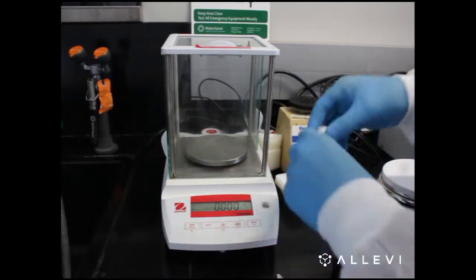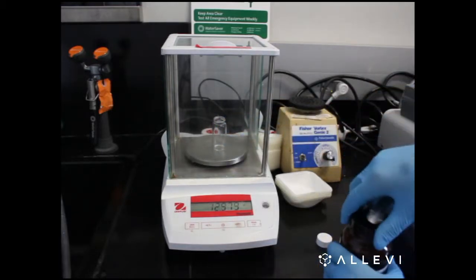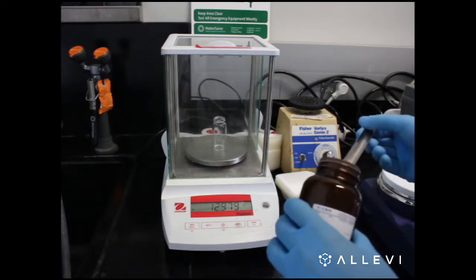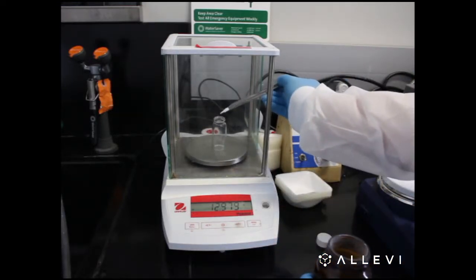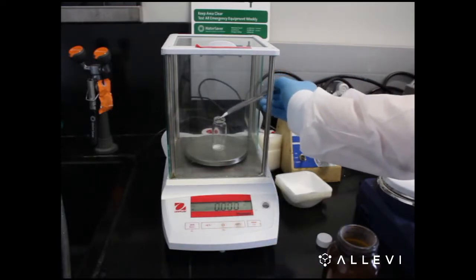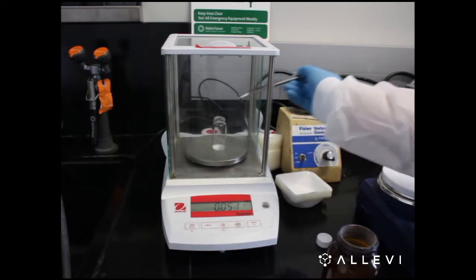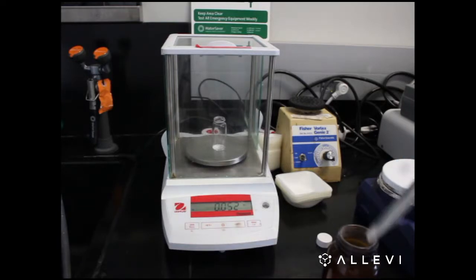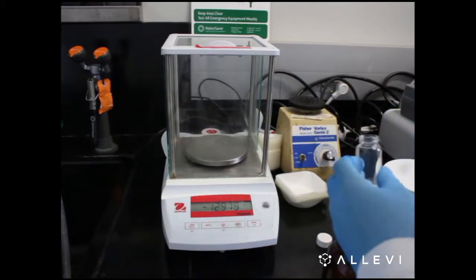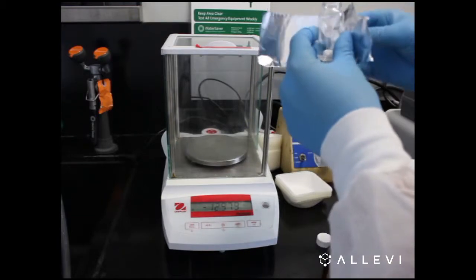Today we're going to make a 10 mL, 10% weight per volume GelMA solution. First, for a 0.5% weight per volume concentration, measure out 0.05 grams of LAP. Next, add a magnetic stir bar and wrap the container in tin foil to protect it from light.